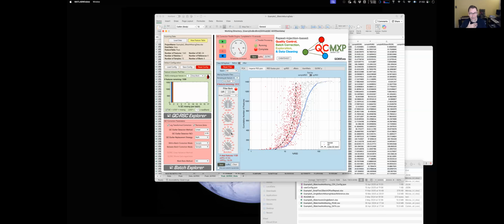I like it because I'm a data scientist and a statistician. Analytical chemists are a little less impressed because it makes their data look rubbish. But really, you can have the best assay in the world, but if there's no biological variance, if your calibration curve isn't steep, you're not getting any resolution in that biology in terms of the signals. So the stats are going to be very clunky.